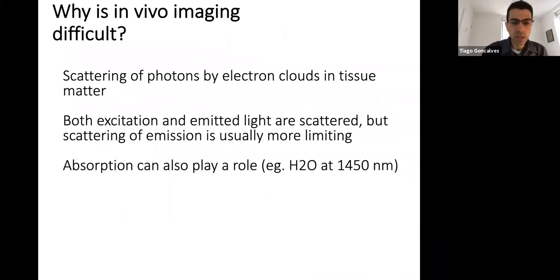to imaging techniques. So hopefully I've convinced you in a couple of examples that there are things that are unique to imaging that, in certain circumstances, can give you very distinct advantages. Not all circumstances, sometimes it's not the best technique to use.